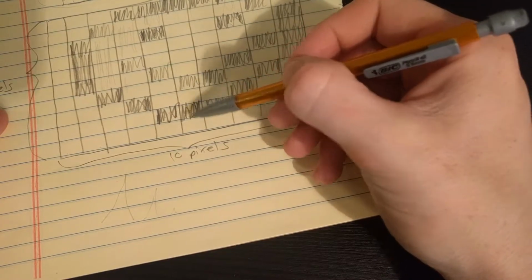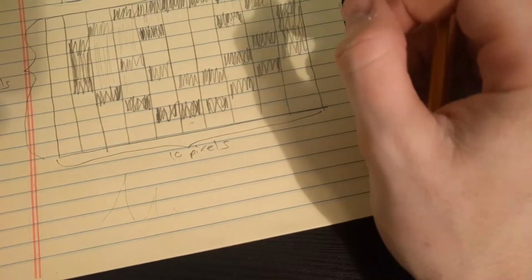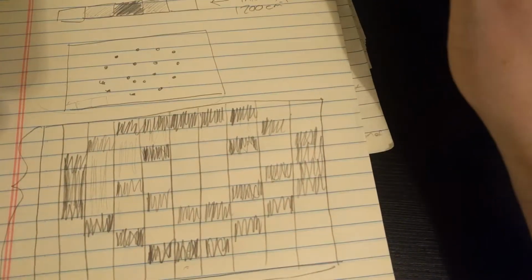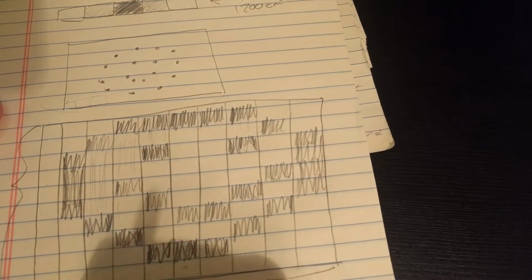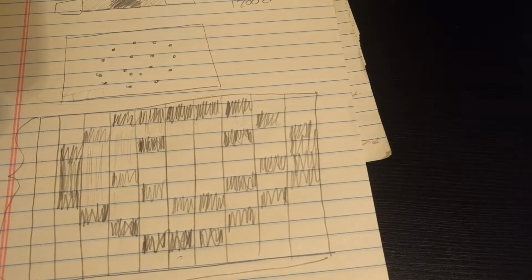So this, where it's dark here and 0 darkness there, is kind of ignoring things like resolution. And I'm also ignoring the fact that we're imaging single molecules, and things such as noise. I'm not thinking about those. But I think you still get the point of how you can get an image from the way the molecules are distributed on the substrate. And now hold on a second, there's more I want to talk about.